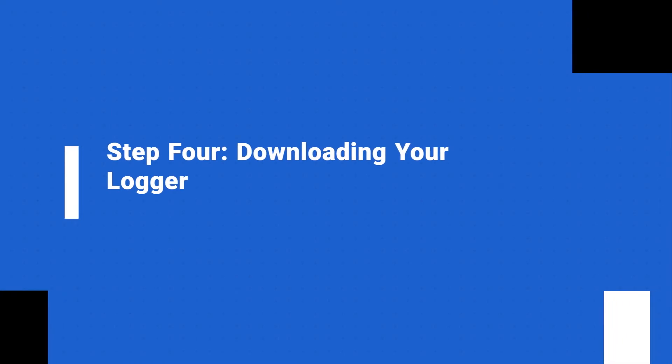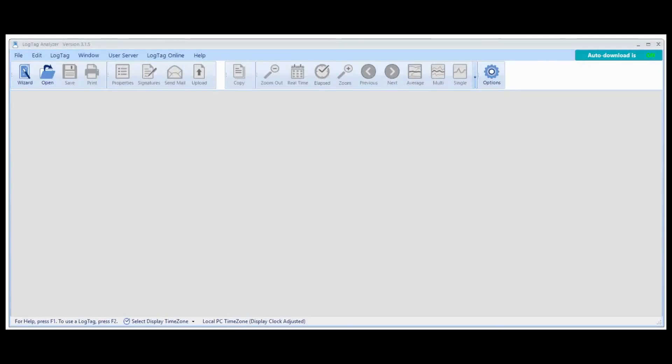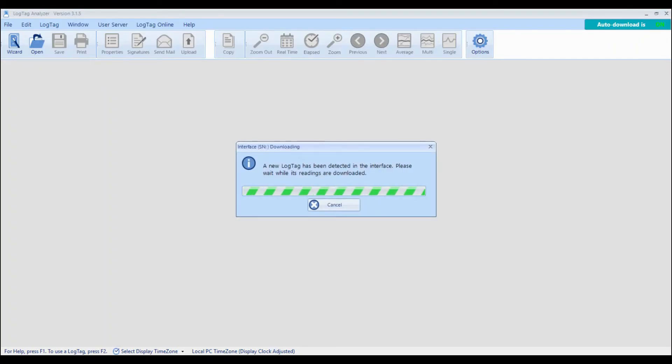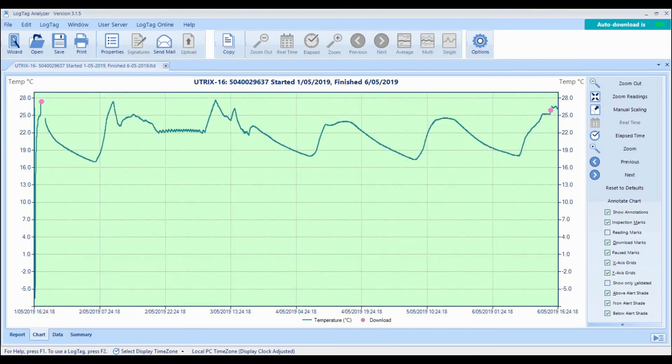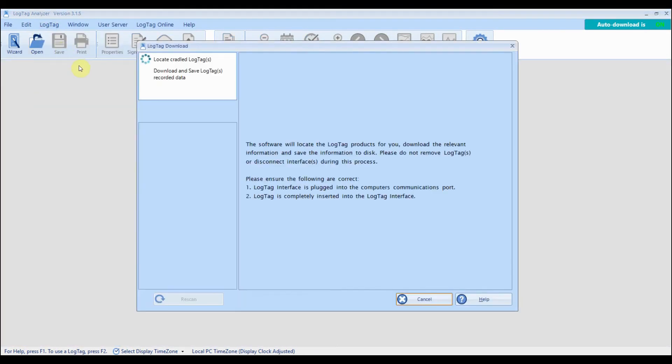To download and view your results, open LogTag Analyzer then connect your USB logger to your computer. If auto-download is enabled, LogTag Analyzer will automatically display a chart of your readings. If not, click LogTag from the main menu then click Download.